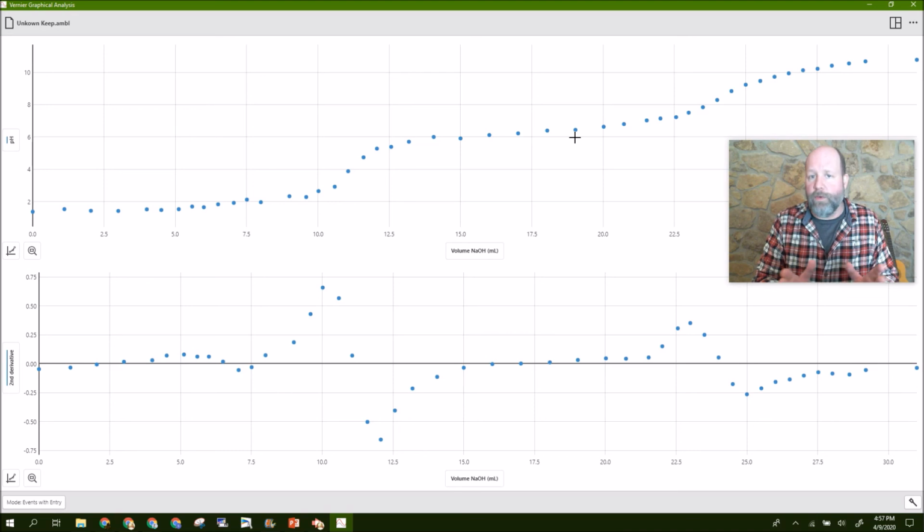If you have questions, of course, make sure you shoot me an email. I can pull this up and we can walk through it together. It shouldn't be a problem. We can do it all on a Google Meet or whatever. Now, this one is an unknown acid. I'm not telling you which one it is, but you do know it has at least two protons on it. So you're going to find the Ka1, you're going to find the Ka2, and you're going to use those in the table of acids that I give you to determine which acid I used for this titration.